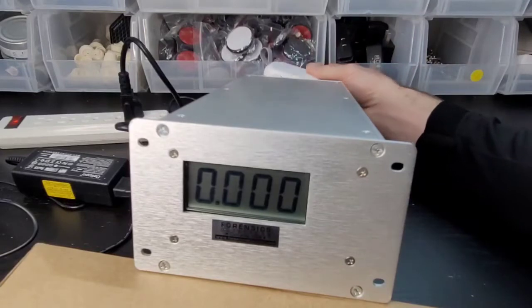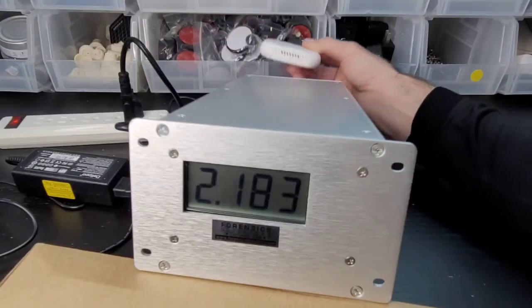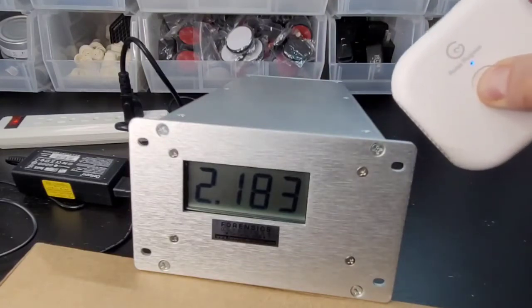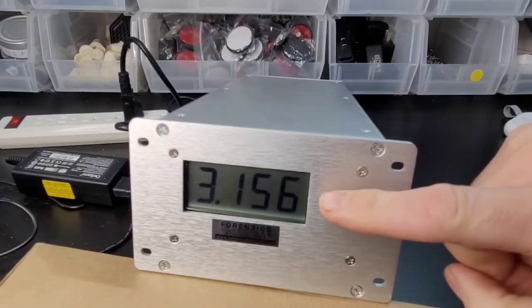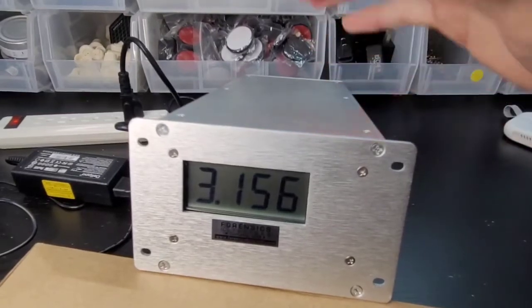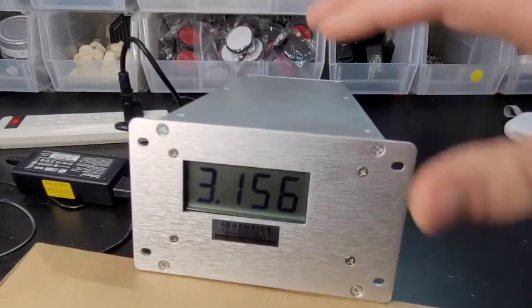So I'll do that now so you can see the analyzer drawing in the air coming from the small bump tester, and you will see the analyzer responding. And the purpose of doing this, here we go. The purpose of doing this, once you've recorded, you could take that off and press that to the off position. Now, once you have a positive reading, you are certain the analyzer is operating. It hasn't been damaged in shipping, or no components have fallen loose where it isn't reading at all.